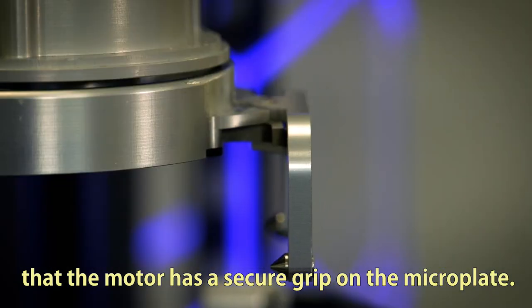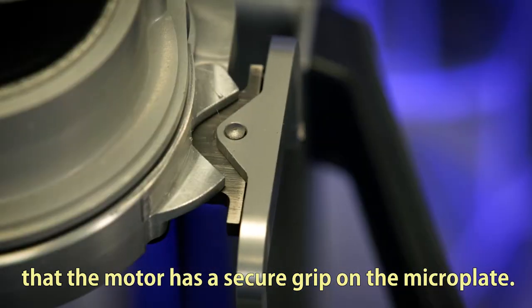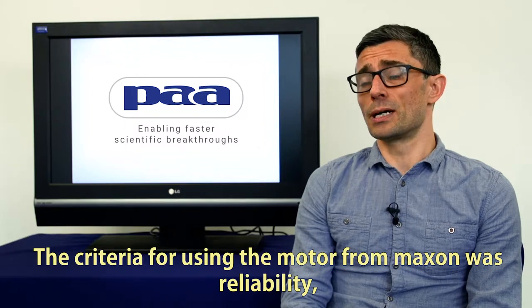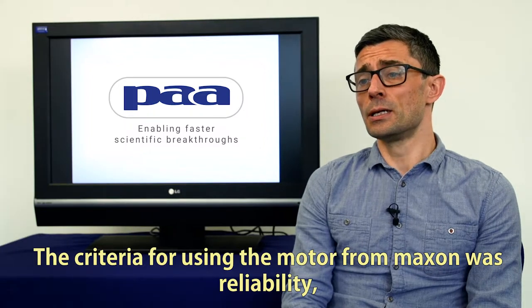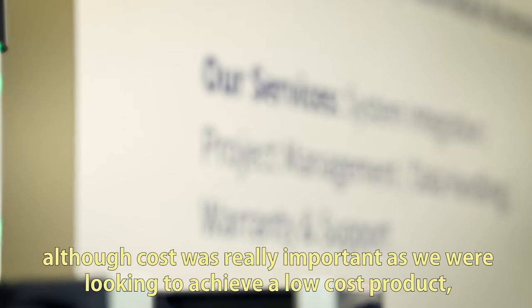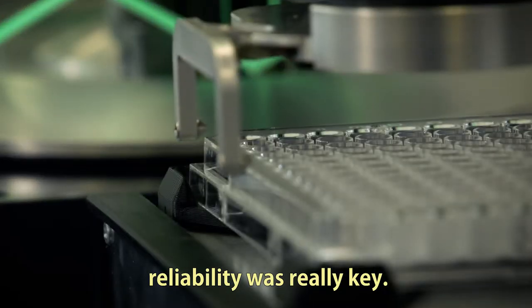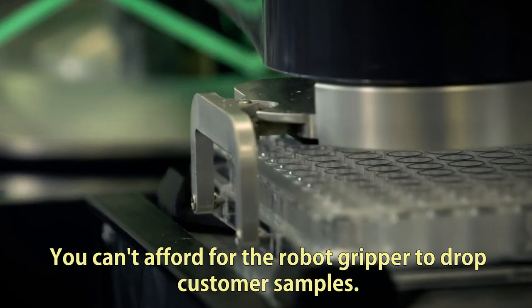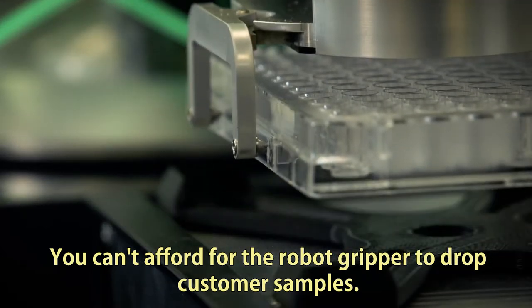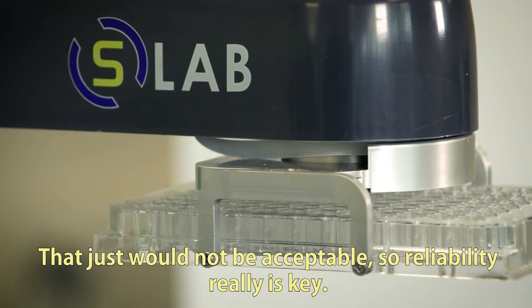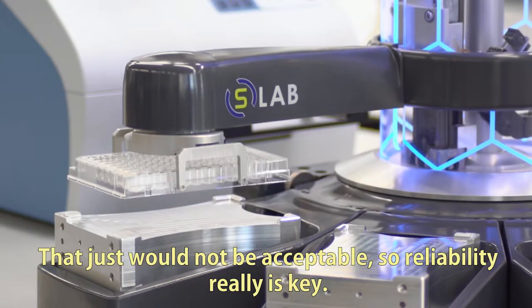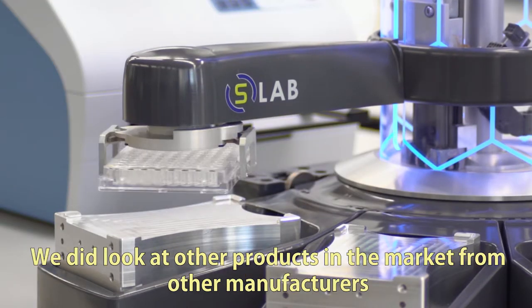The criteria for using the motor from Maxon was reliability. Although cost was really important, as we're looking to achieve a low-cost product, reliability was really key. We can't afford for the robot gripper to drop customer samples - that just would not be acceptable, so reliability really is key. We did look at other products in the market from other manufacturers.